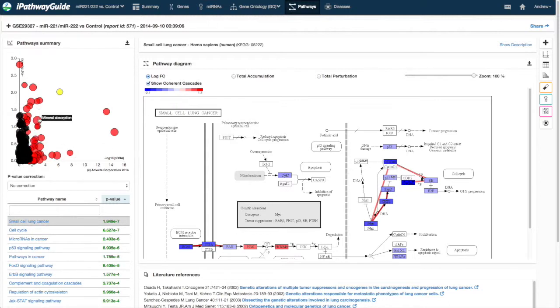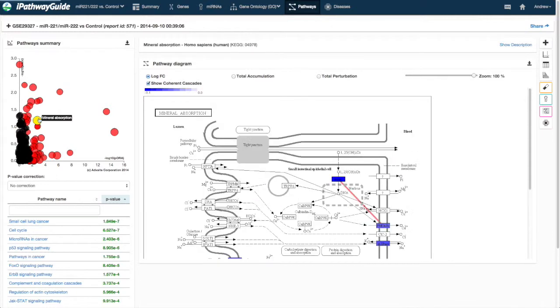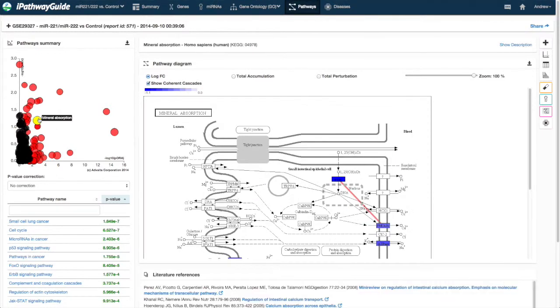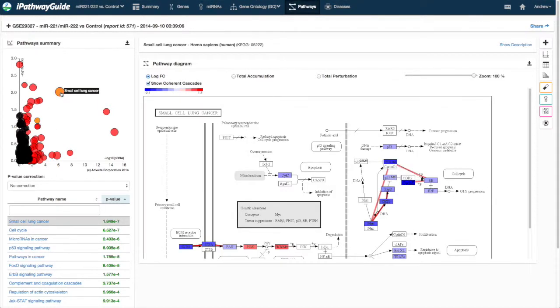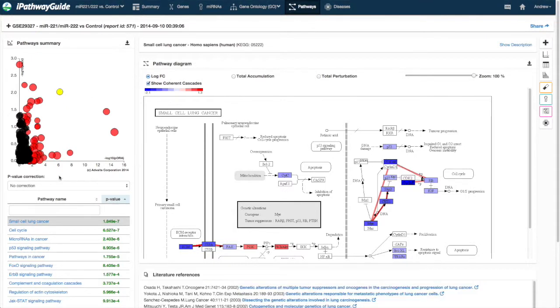Red dots are significant for the selected p-value correction factor, and black dots are not significant. The yellow dot is the currently selected pathway.